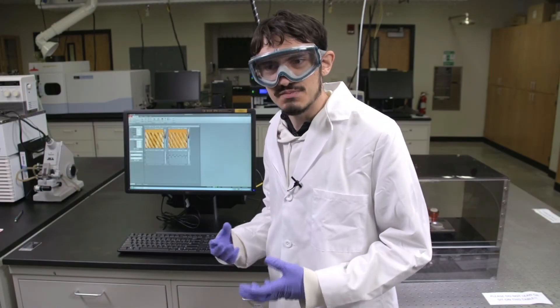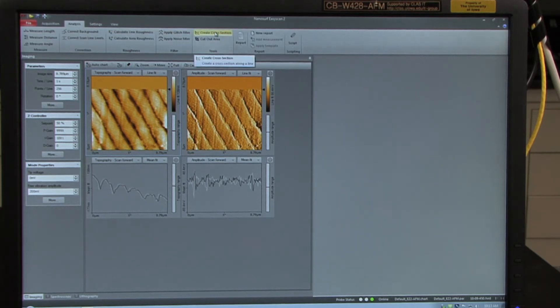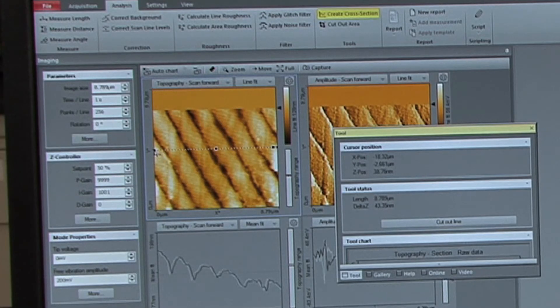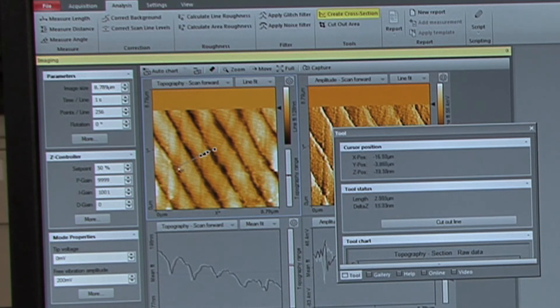Once the zoomed in image has been taken, go to the analysis tab, and click on create cross section. Adjust it such that it only encompasses one ridge.